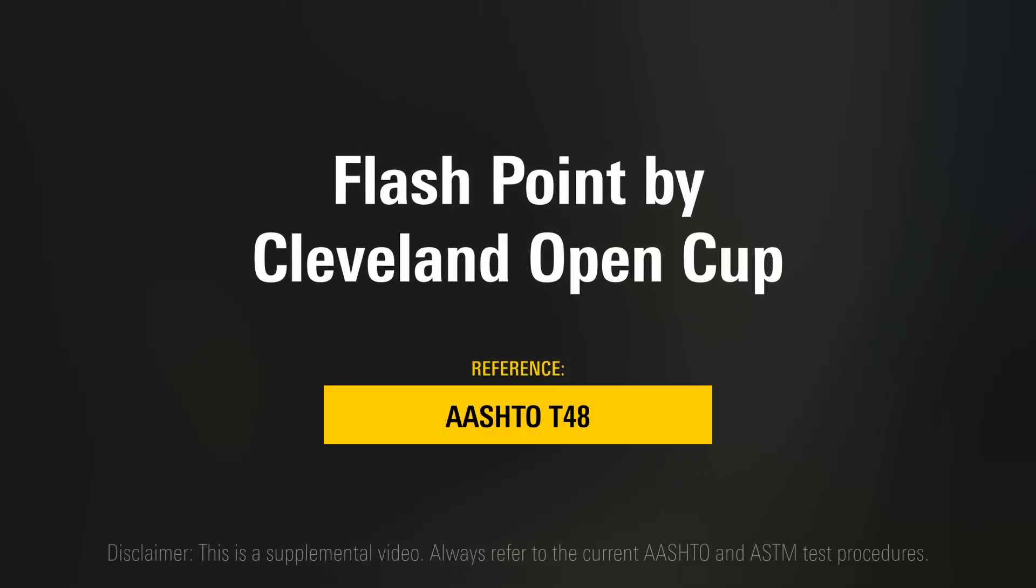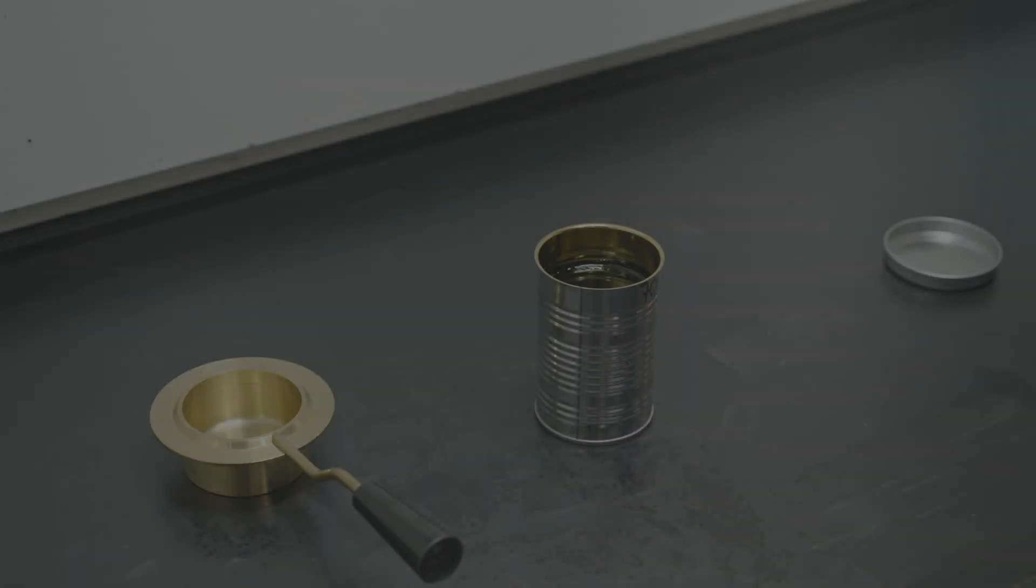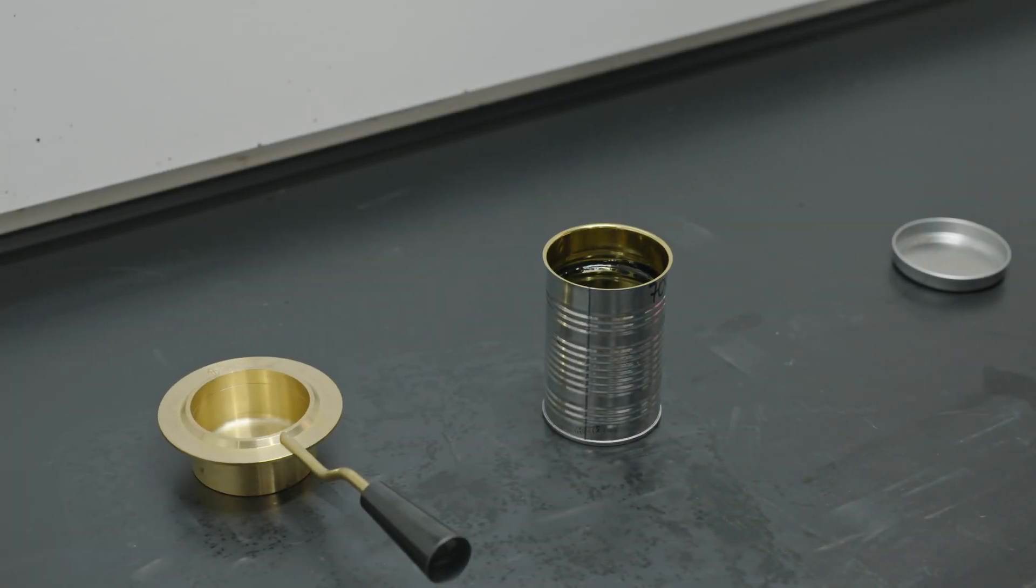Flashpoint by Cleveland Open Cup. Clean and dry the sample cup before each use.